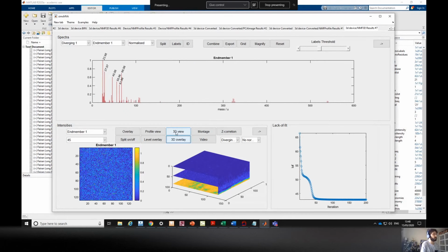There's also this 3D view where you don't necessarily overlay, but you explore them with these 3D renders. But it's very similar. Well, I did not mention, you can do all the normalization things we spoke about before. And that's it. Again, we're doing NMF where we could have done PCA, and this will look very similar. But instead you would have had this from negative to positive. If we have time, we do PCA later, but it will look very similar.